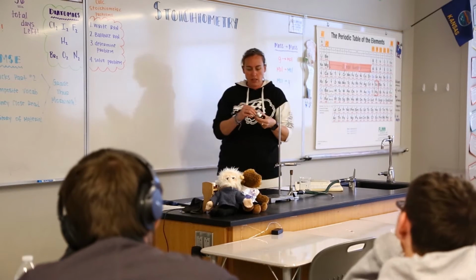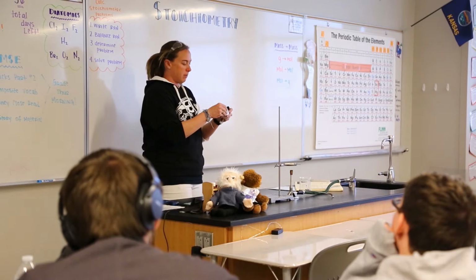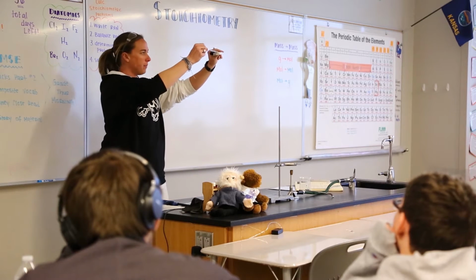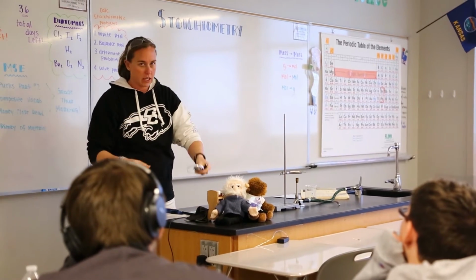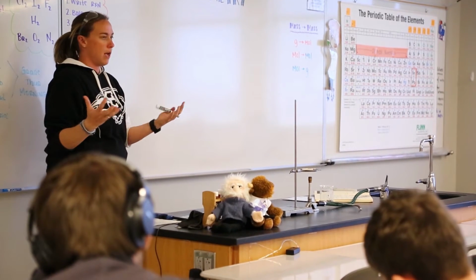And it comes in these little strips. I mean, it comes in lots of different forms, but one form is in these little metal strips. And if I find the end of it, there it is. So these little metal strips, right? And we're going to burn one of these guys and produce magnesium oxide. We're going to predict how much we should get and then find out how well we did, okay?